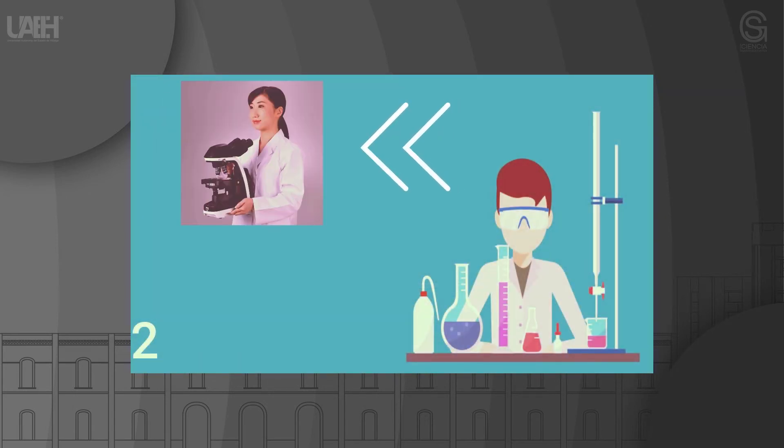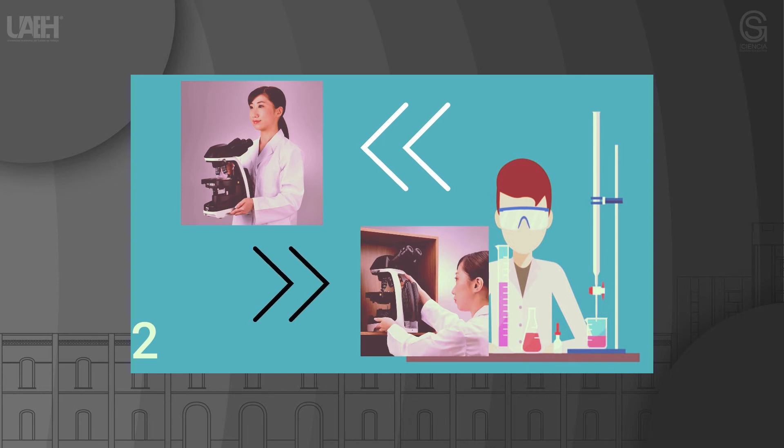Tip 2: If you have to move the microscope to another place, always use both hands. Grasp the microscope by its arm, and place your other hand under its base to keep it in an upright position.